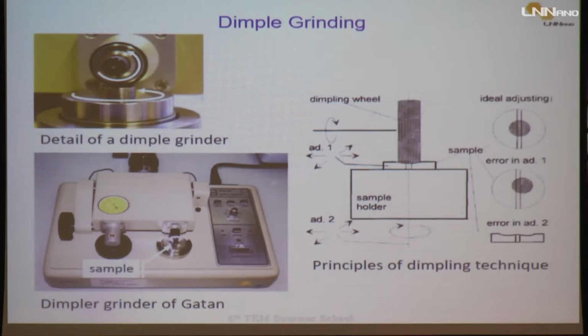And now we use smaller abrasive particles to minimize new damage. You are just removing what was previously damaged. And then you go with a series of different abrasive pastes. All these pastes will have smaller and smaller grains of abrasive particles to have smaller and smaller damage in your sample, okay? And with this, we will finish with what?